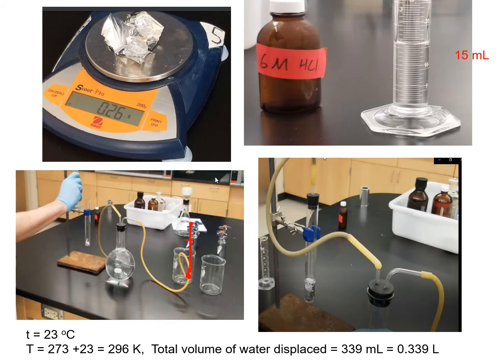Alrighty, so I'm going to show some experiment here. You see that? This is the aluminum foil. Take a small piece of aluminum foil and put it at the top of the balance here. So it is showing a number. The mass of the aluminum foil is 0.26 gram. You need to record this number exactly as shown by this balance. So record this 0.26 in your notebook. Otherwise, you cannot do calculation later.